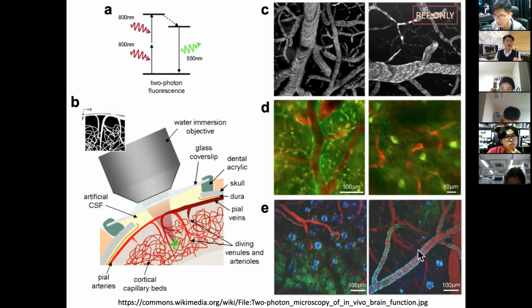And another very interesting part is neurovasculature, because many of the modern diseases are related to neurovascular origin. So you want to study vasculature, and here you can actually have this fluorescence coming specifically from smooth muscle cells that wrap around the artery. Not the vein, but the artery has this because you have to control this blood flow.